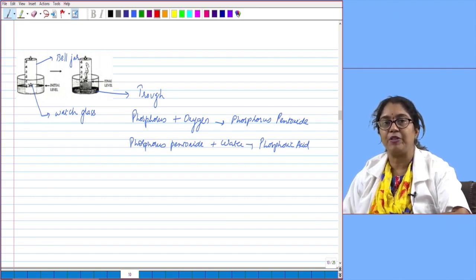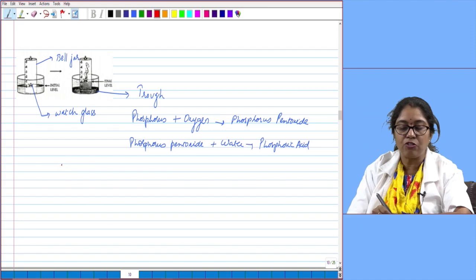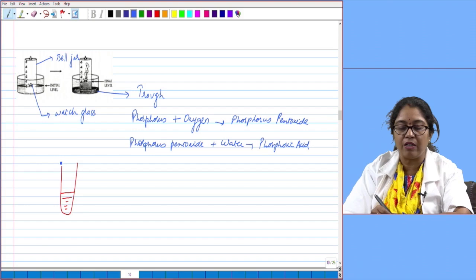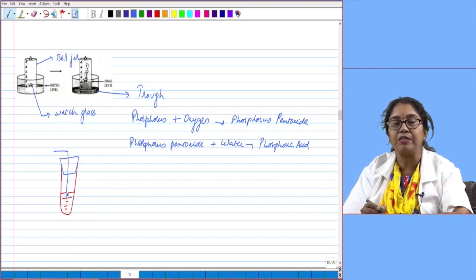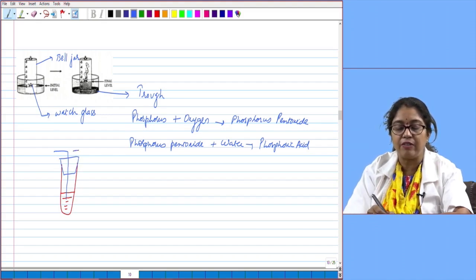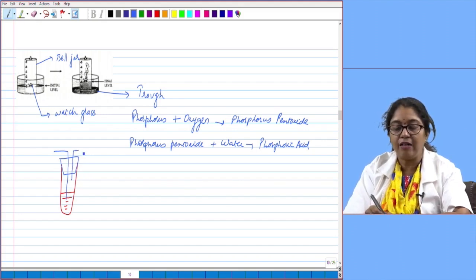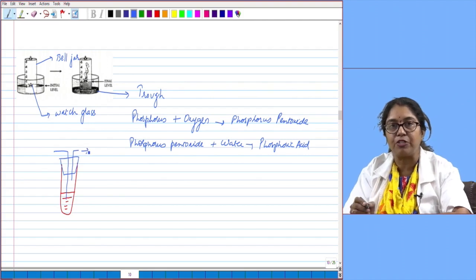air contains carbon dioxide. For this, we need to take a glass test tube and fill it with lime water. Then we are going to fit this with a 2-hole rubber cork. Through one hole we insert a delivery tube such that it is immersed in the lime water. Through the other hole, we insert another delivery tube, the end of which is above the lime water. Then we suck air through this particular tube.